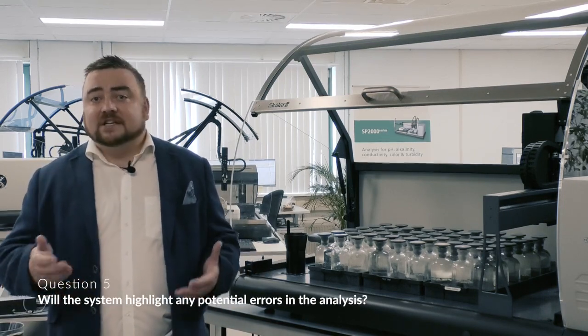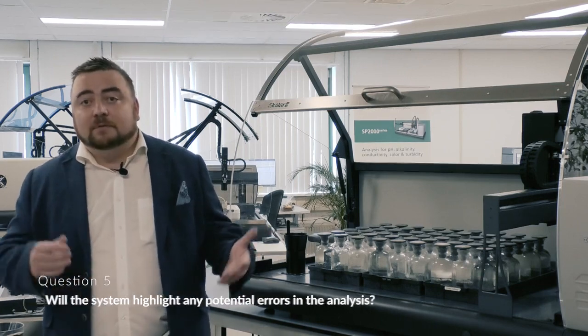Will the system highlight any potential errors in the analysis, and will it select the best results for reporting? So yes, in principle, the most common practice is that traditionally on the manual method, you would report the result which used the lowest dilution factor, which just means that any potential error from within that manual procedure is multiplied by a smaller number. Also, what you see at some customers, if there have been multiple dilutions on a single sample, is that we can take all 3 results and calculate the mean BOD result based on all the dilutions performed on a sample.